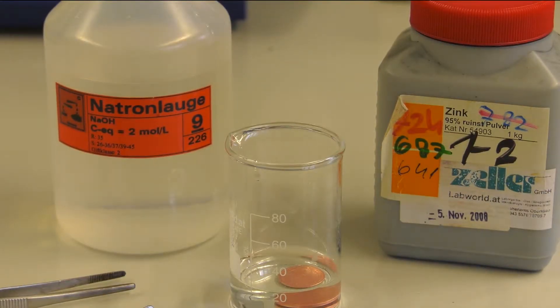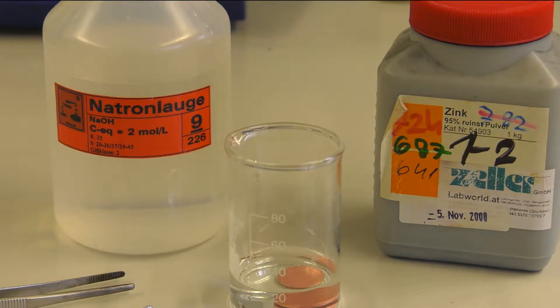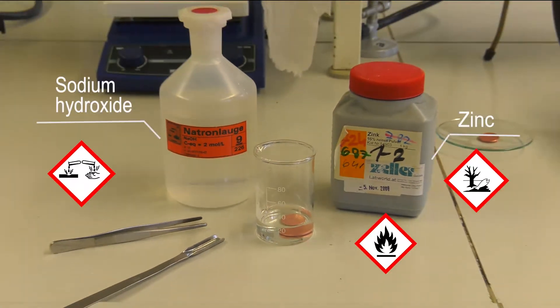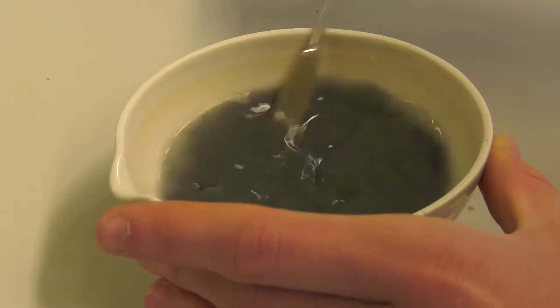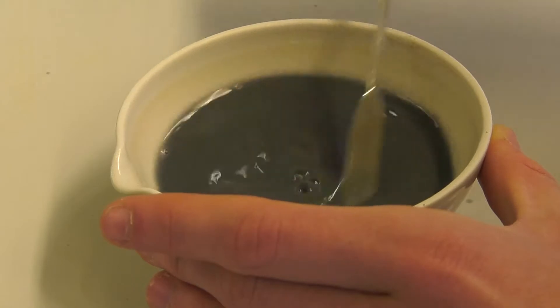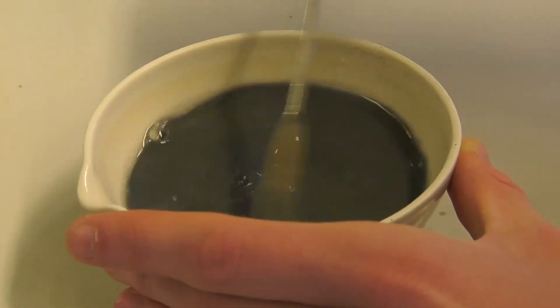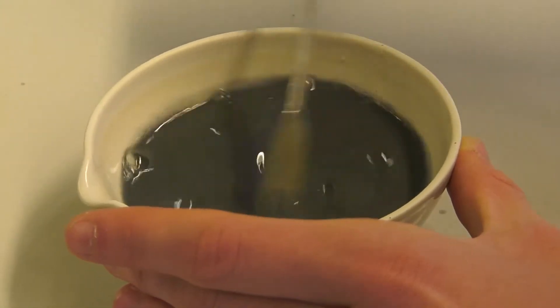Please consider the guidelines concerning the waste disposal, which are shown at the end of the video. For the golden coin experiment, you firstly have to dissolve 4g of sodium hydroxide in 50ml of water in a 100ml beaker.